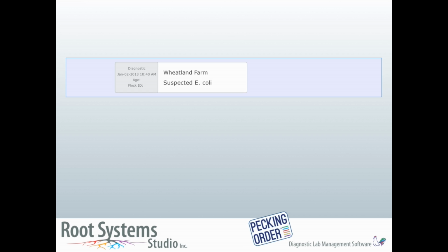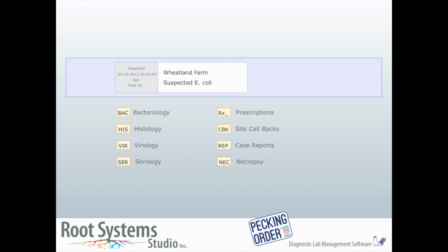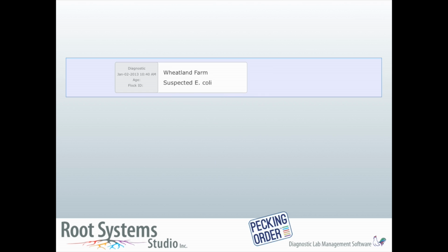Let's consider anything we do for a case to be a service. Everything from bacteriology, prescriptions, histology, site callbacks, virology, case reports, serology, necropsy, and other activities. Broadly speaking, the goal of our workflow is to complete all services within each case.